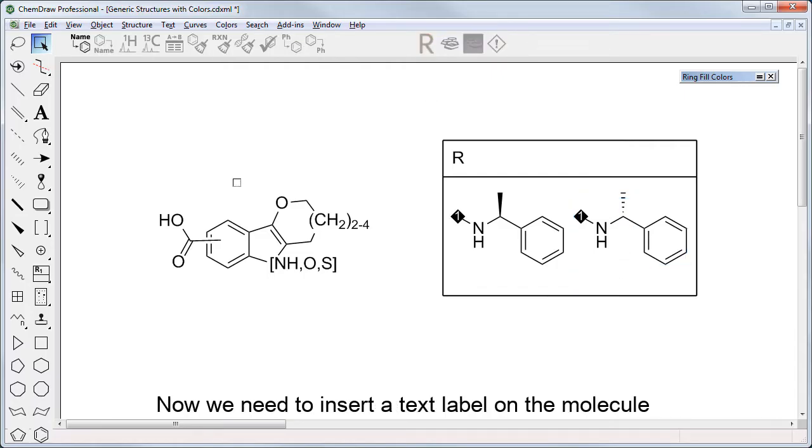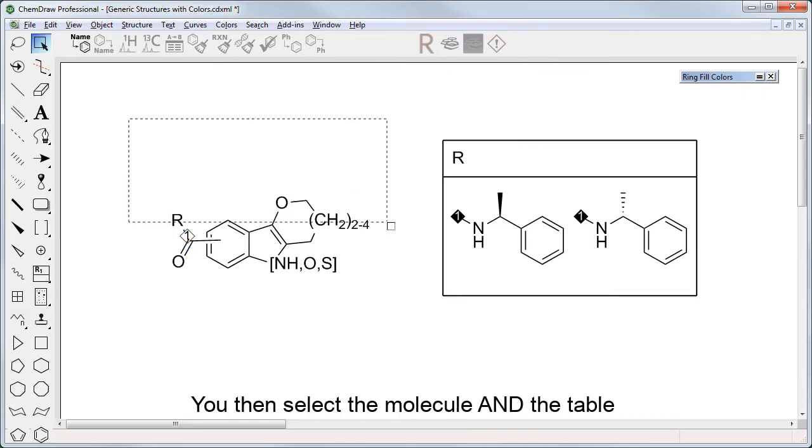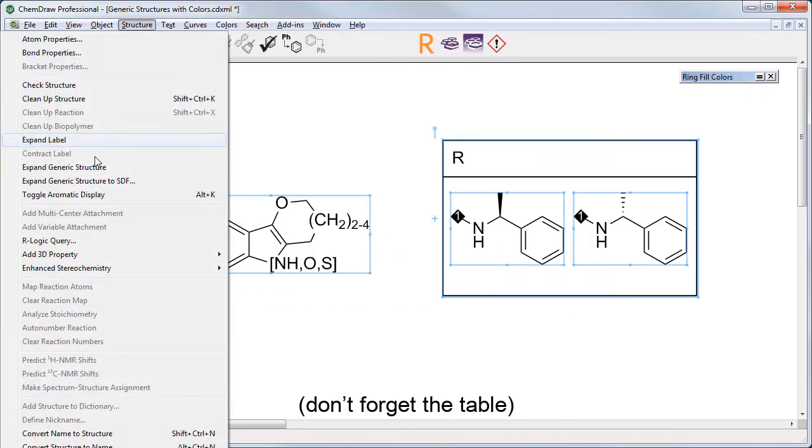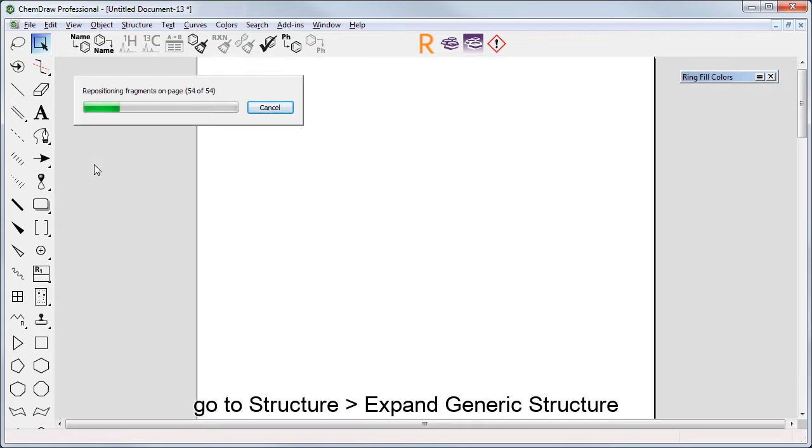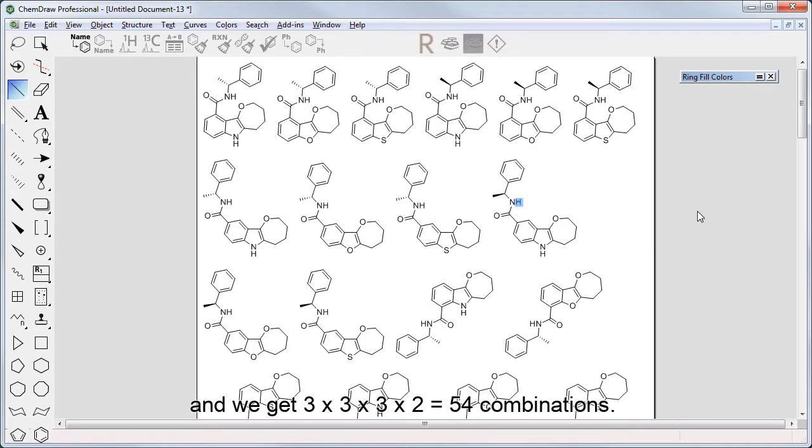Now we need to insert a text label on the molecule that matches the header of the R group table. Then select the molecule and the table, don't forget the table, go to Structure, Expand Generic Structure, and we get 54 combinations.